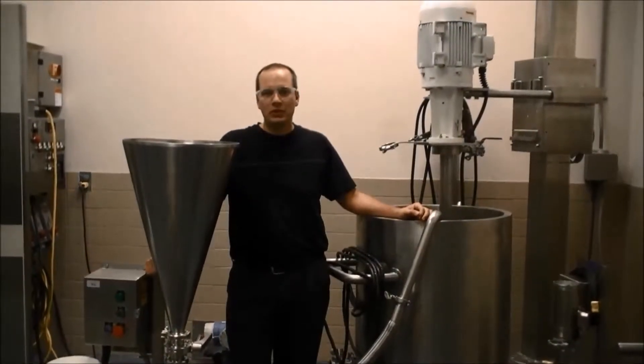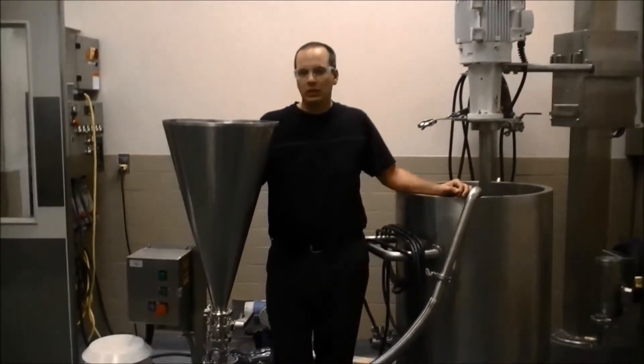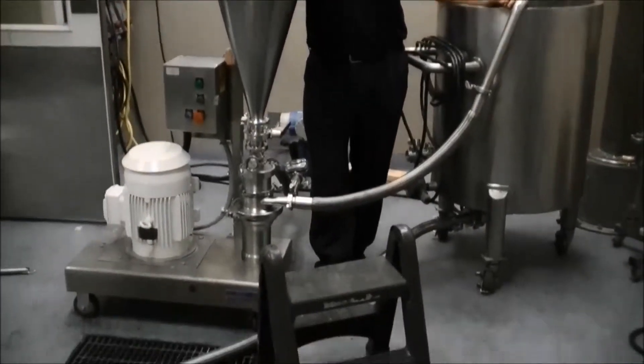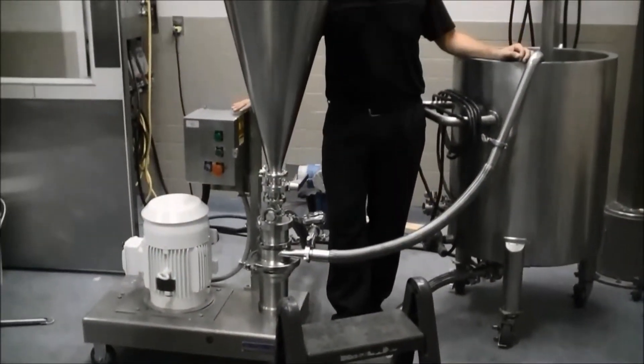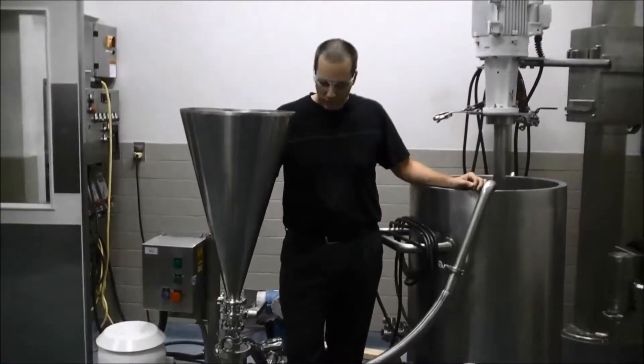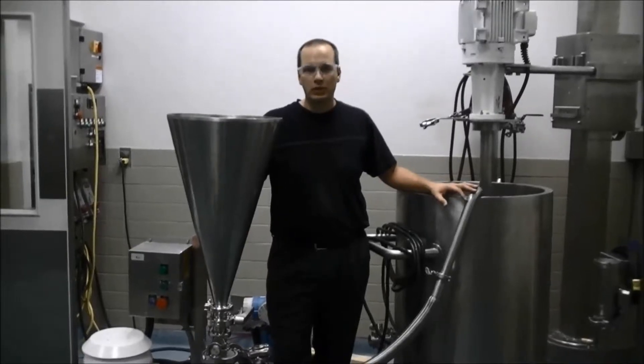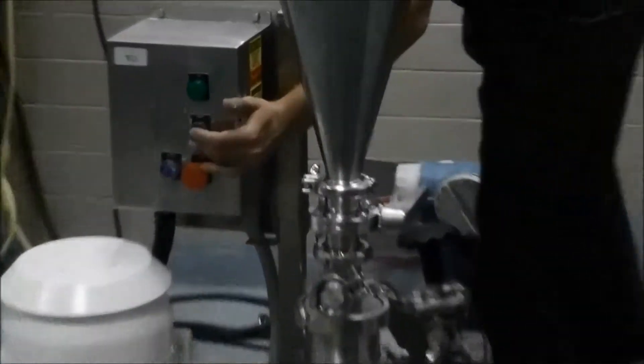Today we're dispersing sodium citrate using our ZC1 powder disperser. We've got about 8.8 kilograms of sodium citrate loaded into the hopper. We're going to be feeding the unit at 35 gallons per minute of water, and we'll start our liquid flow and establish flow into the tank before we start our dispersion. We'll start by turning on the ZC1.